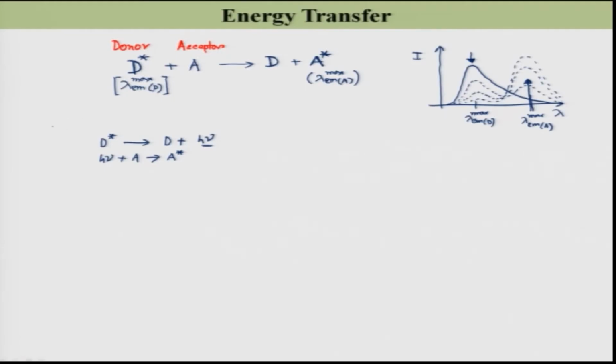So, I can write this as case 1: radiative energy transfer, and this is a two step process.